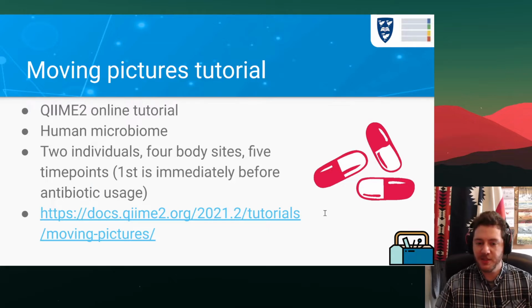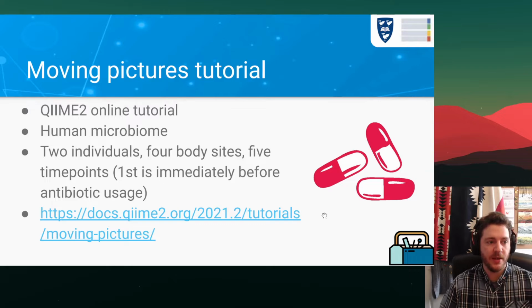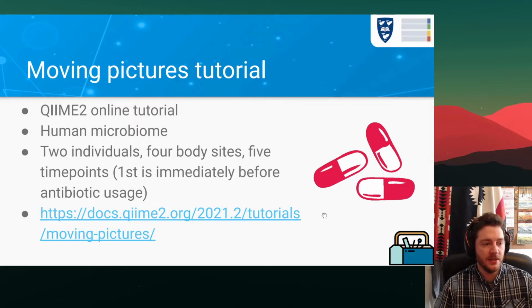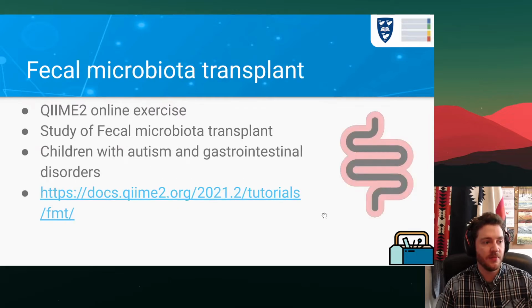So let's talk about some of the tutorials and give you a brief intro to them. The first main one they have, their introductory tutorial, is the moving pictures tutorial. It's an online tutorial. You can download all the data, and it has all the commands. It is analyzing human microbiome data. We talked about this a bit yesterday, with the 2 individuals, the 4 body sites and 5 time points, looking at antibiotic usage and how it affects these individuals.